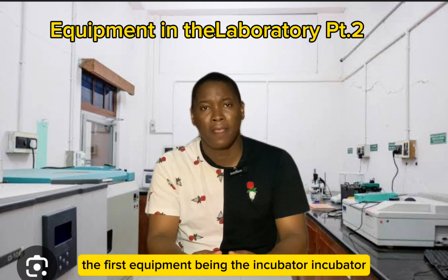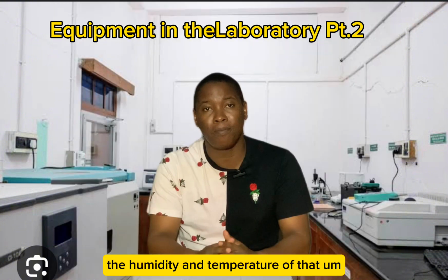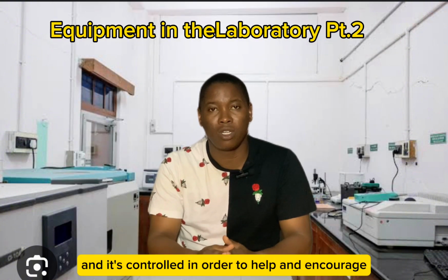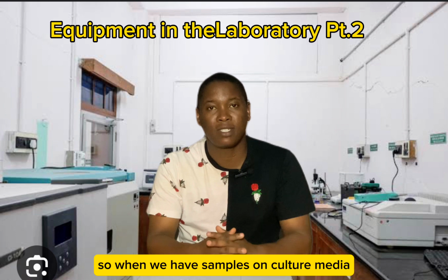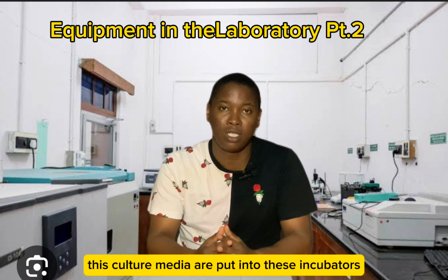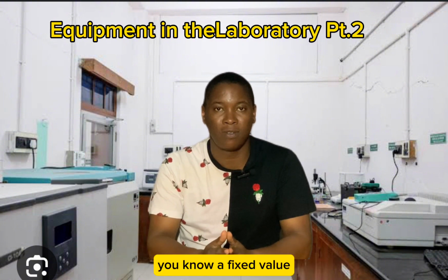The incubator looks like a box, and it's an equipment in which the humidity and the temperature are controlled, in order to encourage microbial growth within media. So when we have samples on culture media, these culture media are put into these incubators, and humidity and temperature are set at a fixed value.